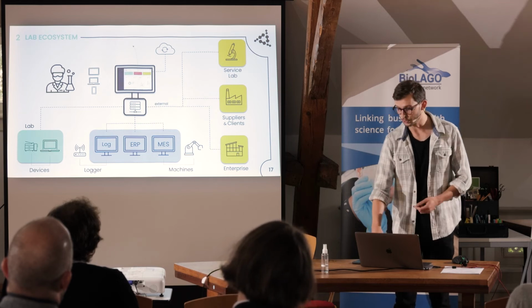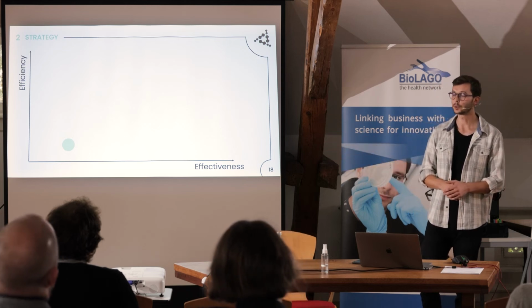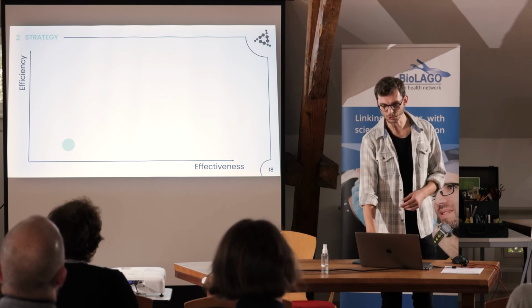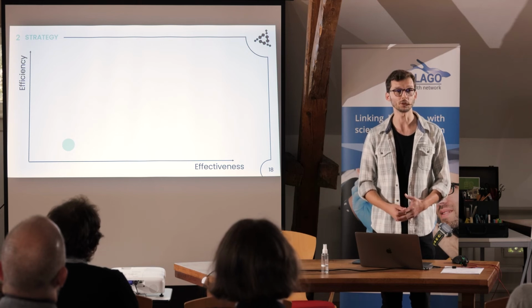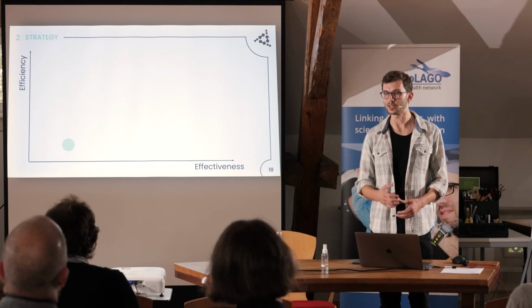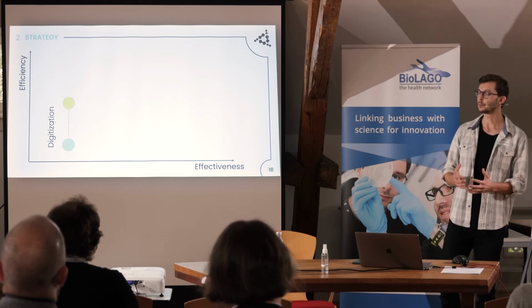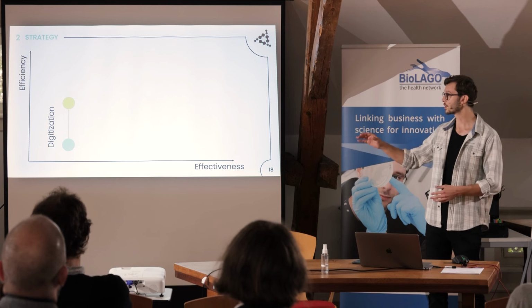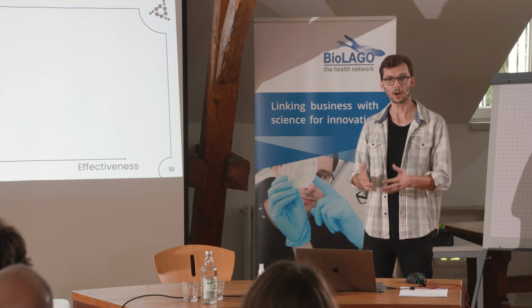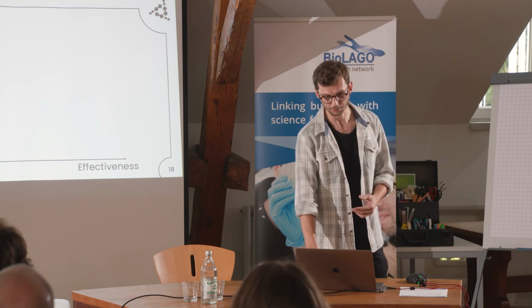If we want to place a quality control or laboratory on a diagram between efficiency and effectiveness, most of the companies are at the green dot and want to install or implement an application, like an app on a smartphone, and wish and hope that this will erase all their problems and be the one and only solution. But if we have long, error-prone, very complex workflows and we just digitalize them, in English there is the word digitization. It's just complex, error-prone workflows in a digital way, but it's not really effective.